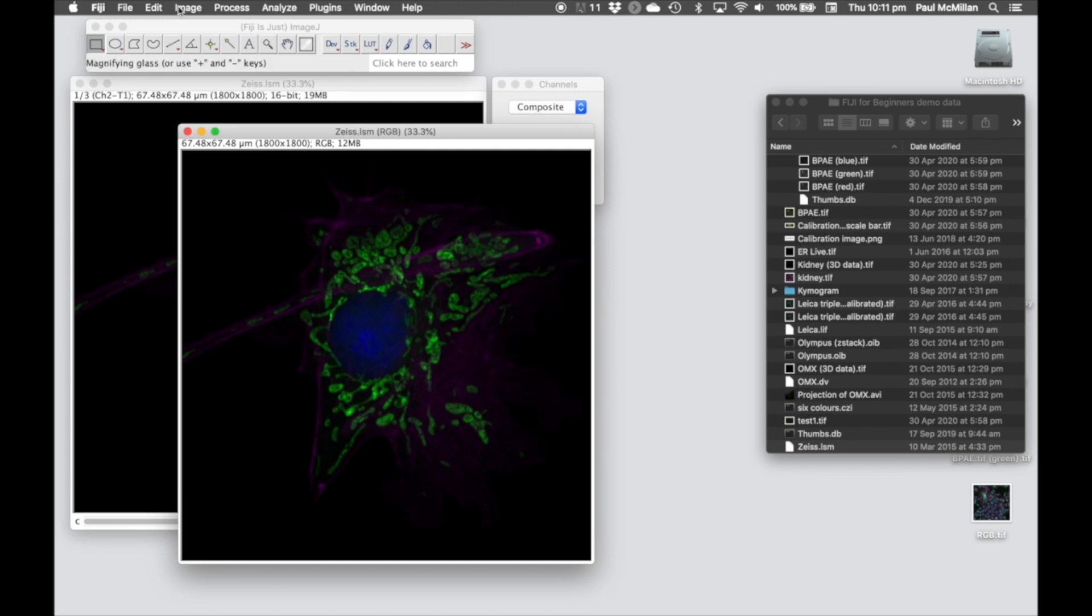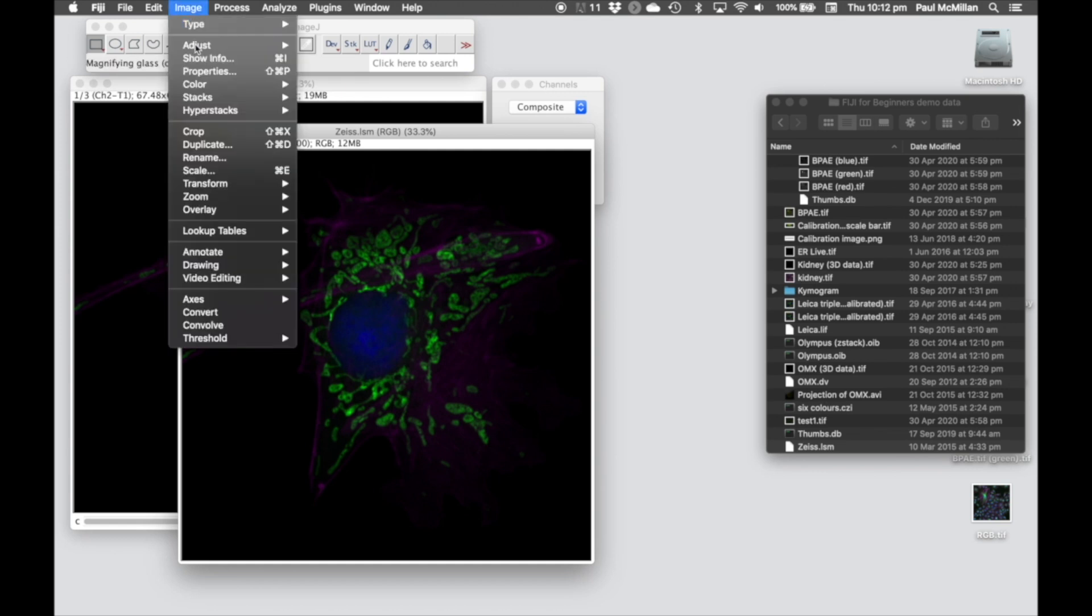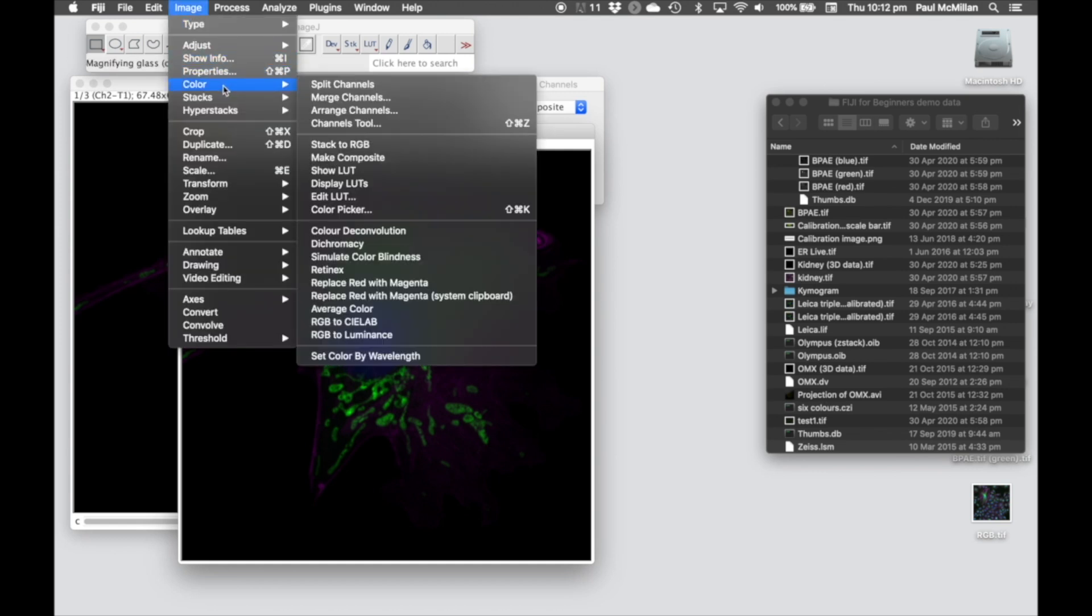Which is under Fiji, Image, Color, Channels tool, Control-Shift-Z or Command-Shift-Z.